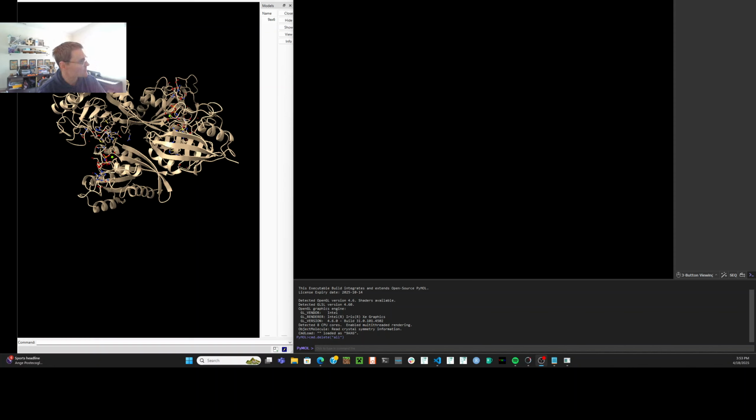So on the left here I have ChimeraX, and I loaded a molecule from the PDB. It's called 9AX6 tricomplex. This is a glycine 12 to aspartic acid mutant. It's associated with cancers. It's complexed with small molecule RMC6236 and cyclophilin A, which is an isomerase that assists in protein folding. This was put out recently by Revolution Medicines.